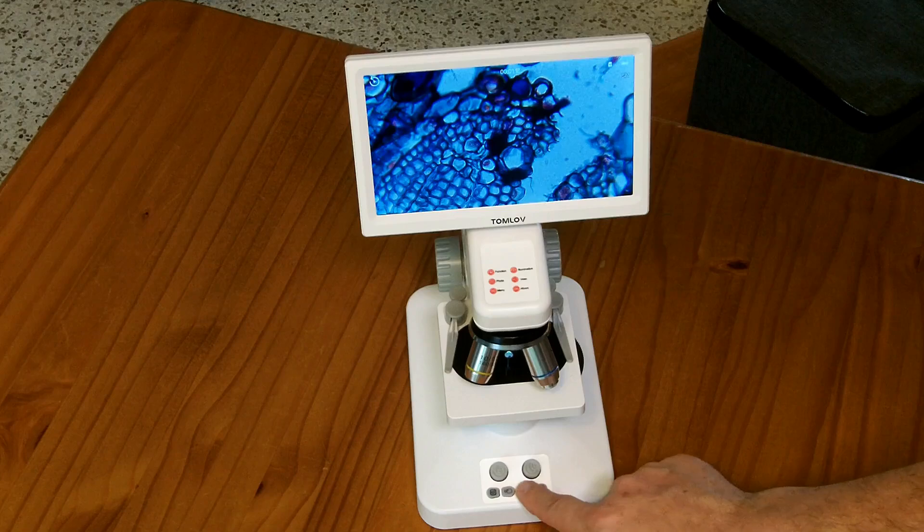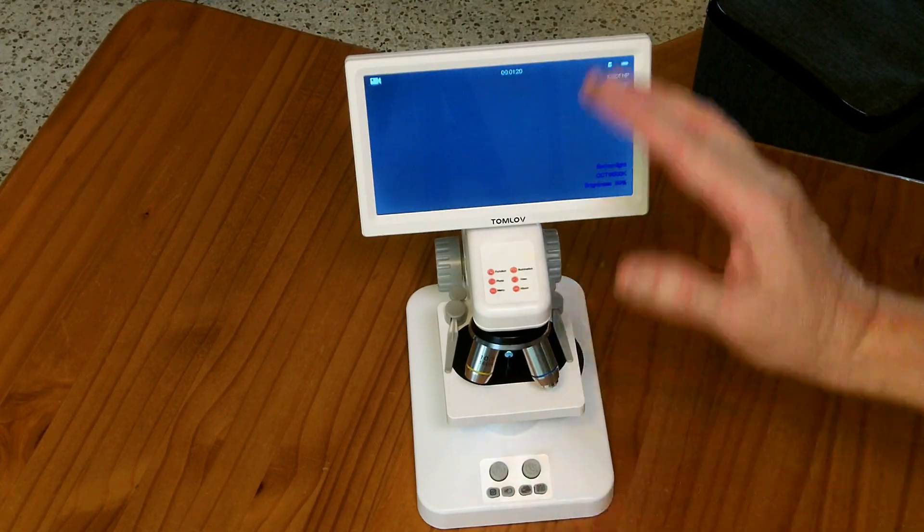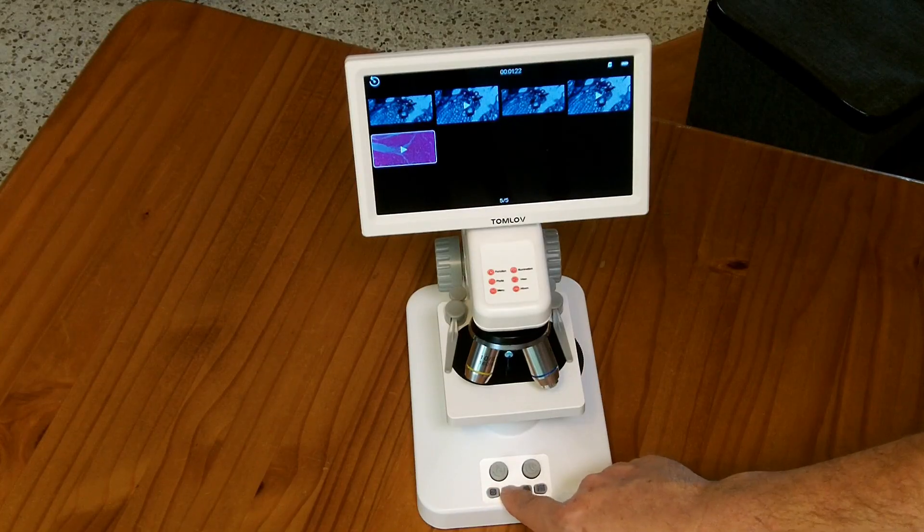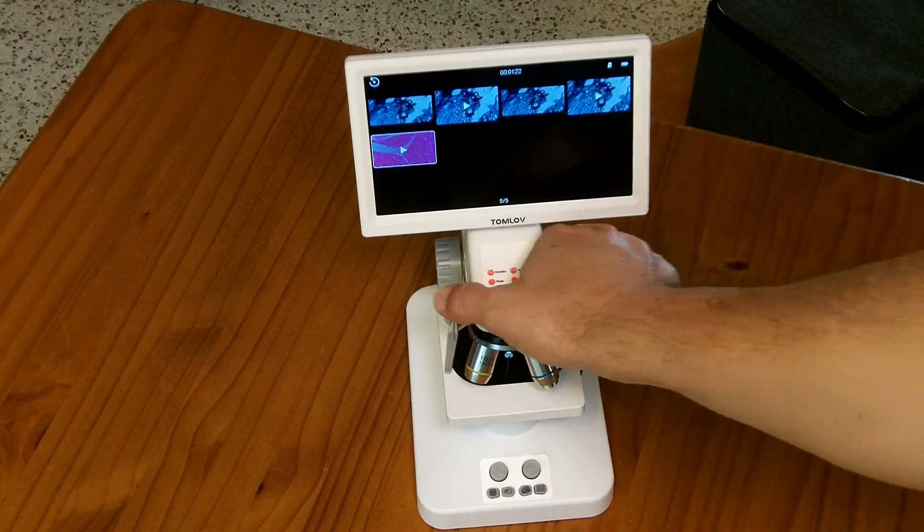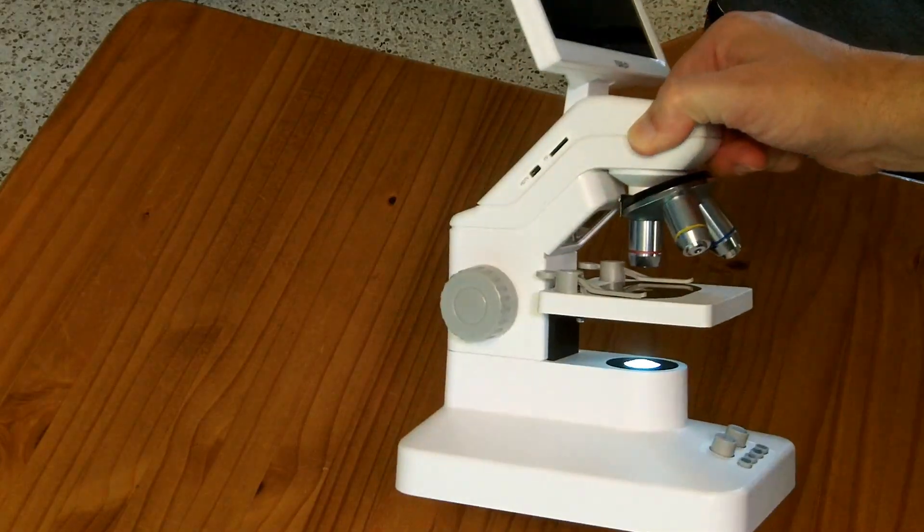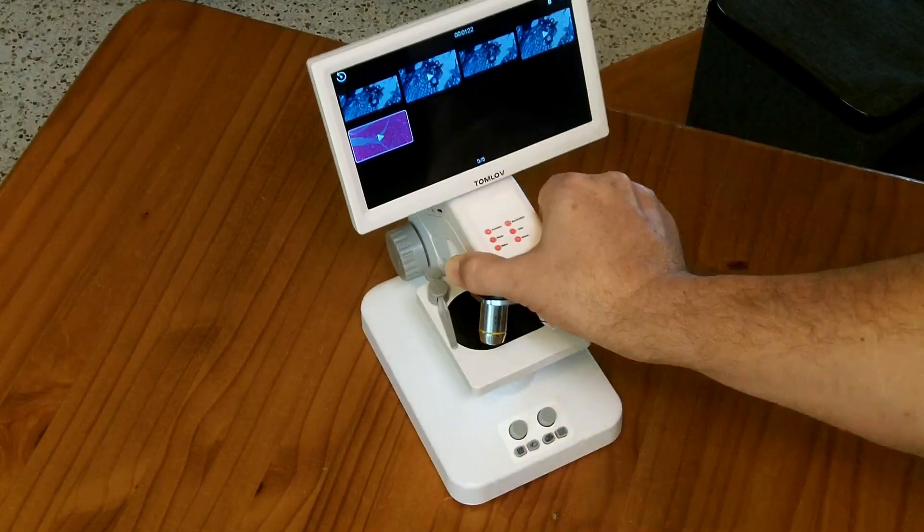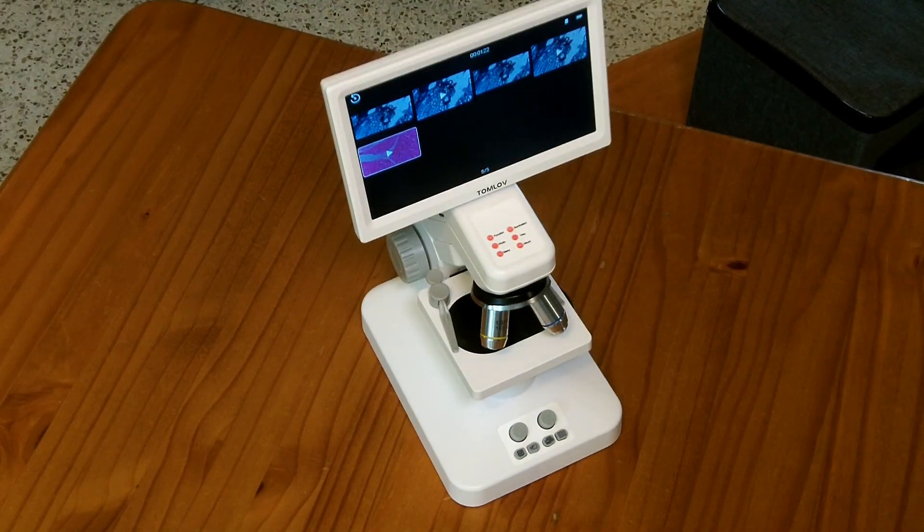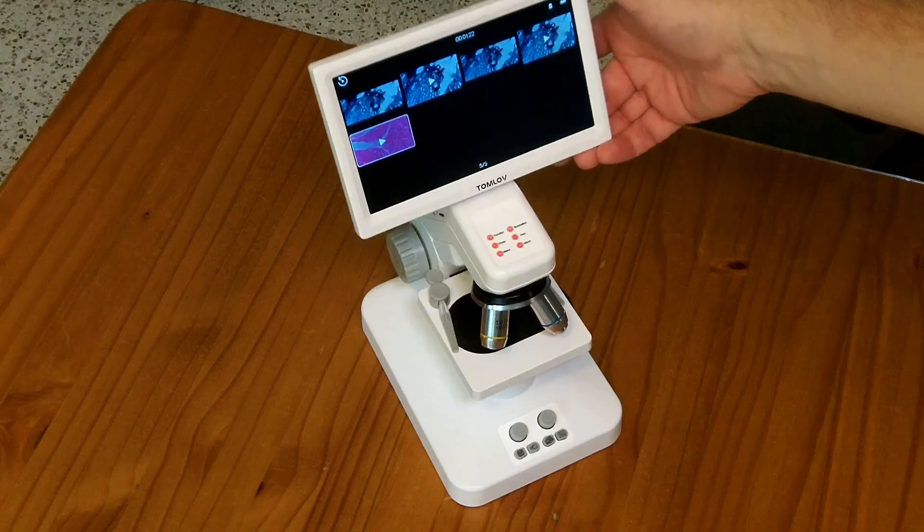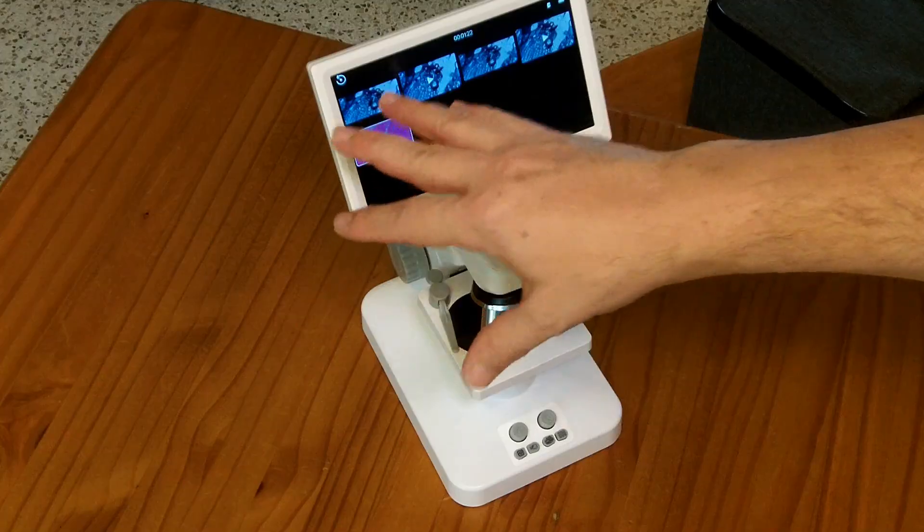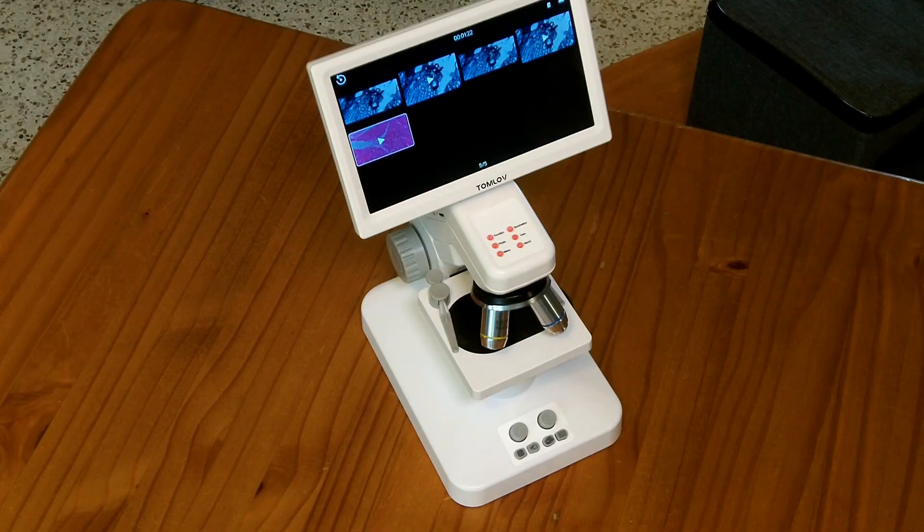I have not tried the export to HDMI. I see no reason why that wouldn't work. You just plug a TV in and then anything that shows up on this screen will show up on the HDMI TV. So if you're looking for a microscope that has a screen to view as opposed to an eyepiece and the ability to export photos and videos on a trans flash card or export to a big screen in a classroom, this guy is doing a pretty good job.